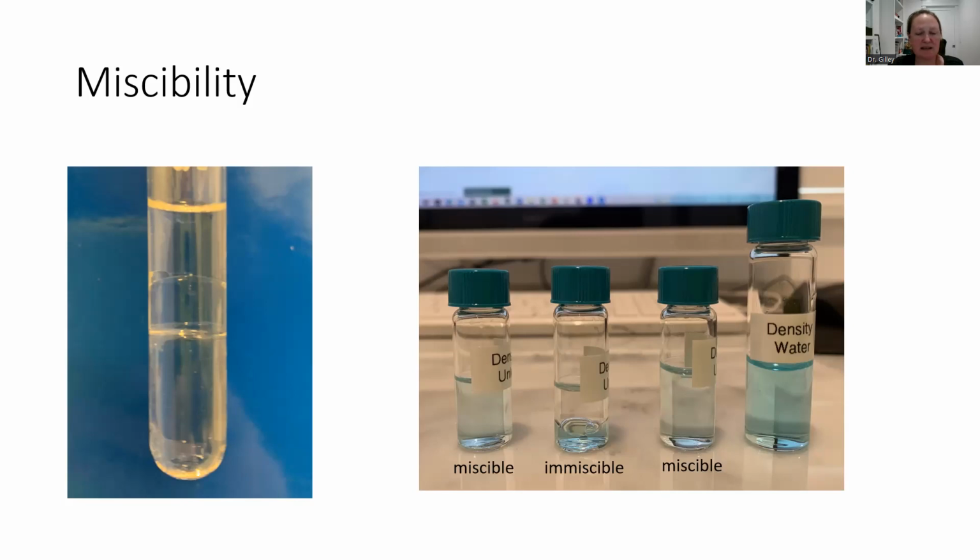And we're going to then make some observations about what happened after you mixed it, right? Is it still three distinct layers? Have all the layers combined, or maybe only two of the layers have combined, and now you have two layers? So you want to take some careful observations of exactly what happened once you mixed those up. And think about what substances might have been miscible in each other, forming one giant layer. And what data do you have to know which substances those are?